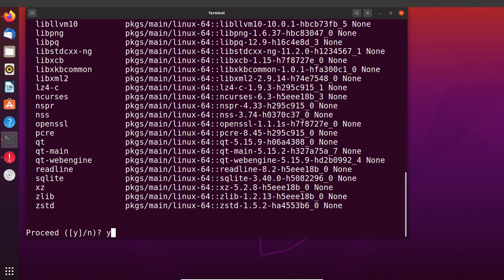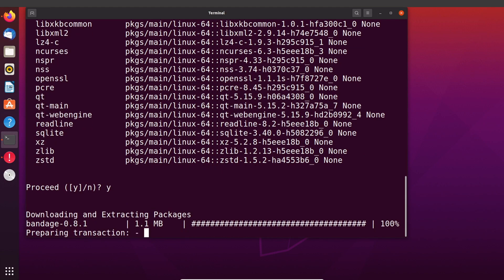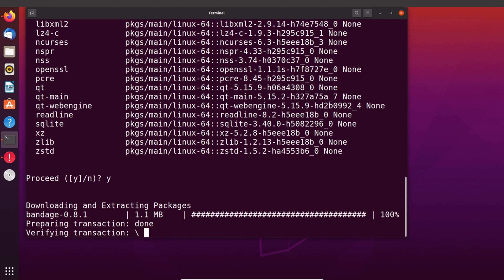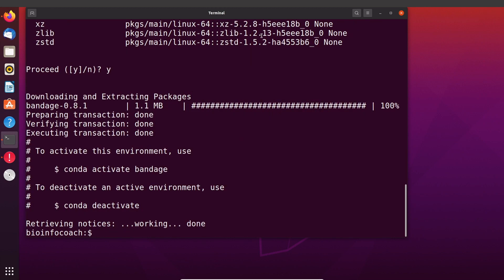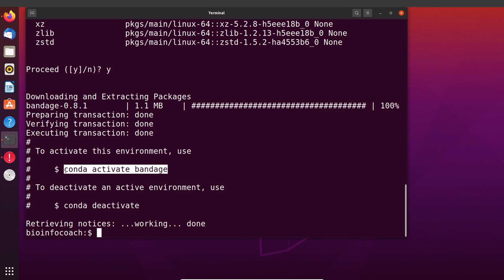Let's type y to confirm. Once we do that, conda will download all the necessary packages and configure them for us. Okay, Bandage has been installed. If you want to use Bandage then you need to activate the environment — the environment is also called bandage. This is the command we use to activate the environment, and if you want to deactivate you will use this command. Now let's test Bandage.